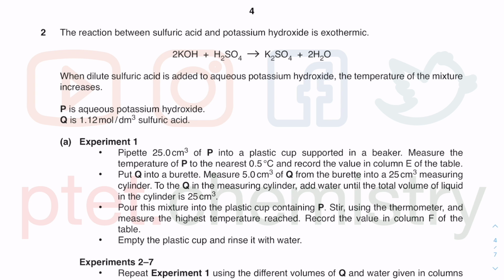My name is Dr. On, and in this tutorial video, we'll go through these particular practical questions on thermometric titrations. In between these tutorials, I'll include the experimental procedures that allow me to collect the set of results that we will analyze later on. This is a reaction between a base, which is potassium hydroxide.